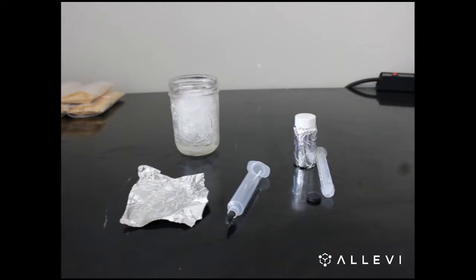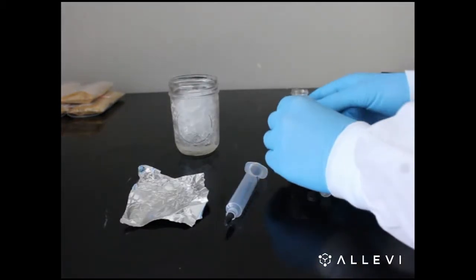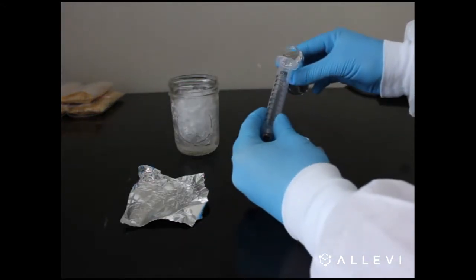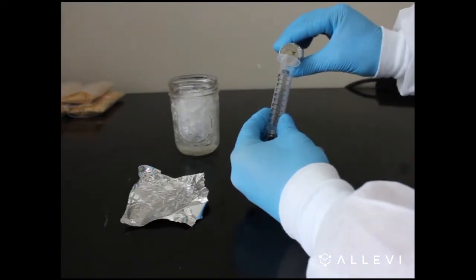After the 2 hours, remove the container from the hot plate. Pour the GelMA into the capped syringe. Today we'll be printing with about 3 mL of GelMA.